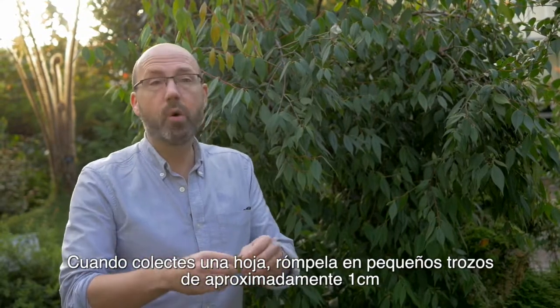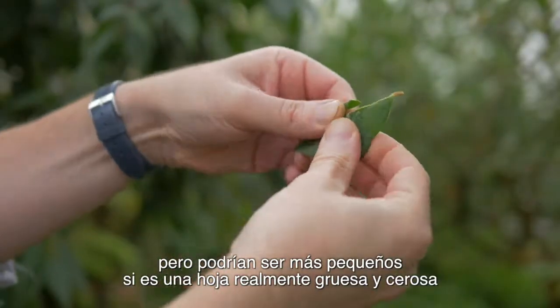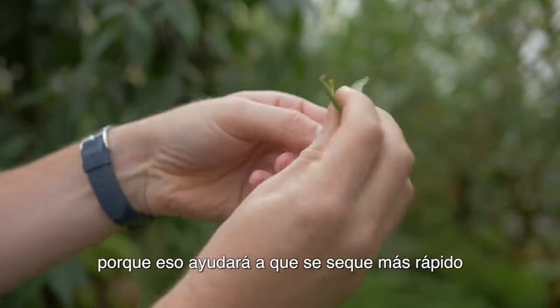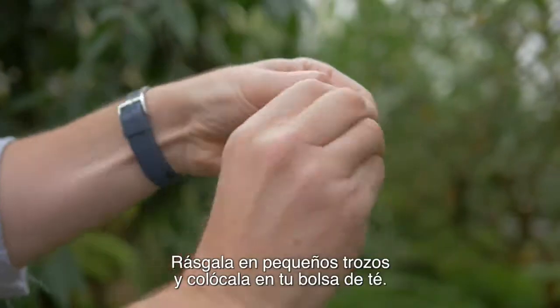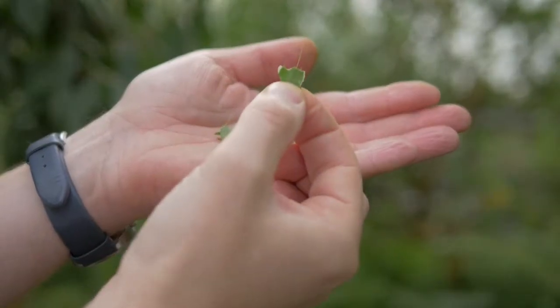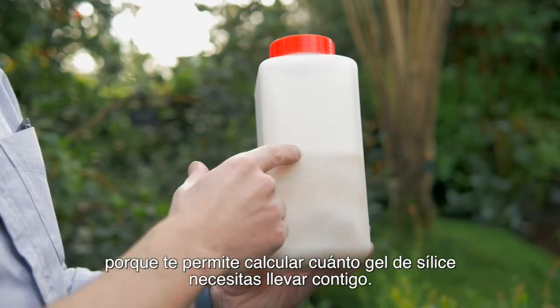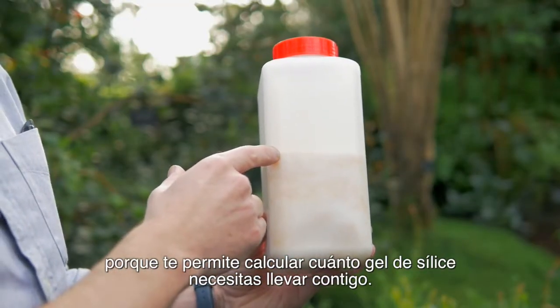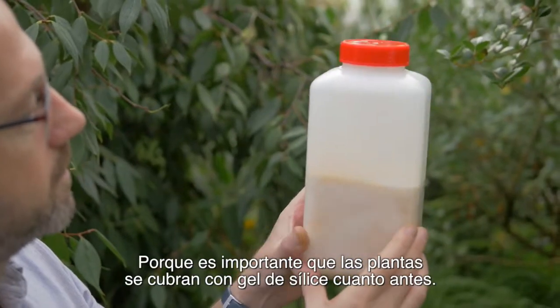When you collect a leaf, rip it into small pieces, roughly about one centimetre, but it could be smaller if it's a really thick, waxy leaf because that will help it dry quicker. If there's a thick midrib, just take it off and discard it. Rip it into small pieces and then put it in your tea bag. It's important to estimate how many collections you're going to make when going into the field, so you can work out how much silica gel to take, because it's really important that the plants are covered in silica gel as soon as possible.